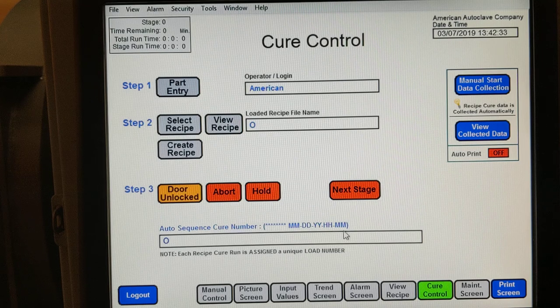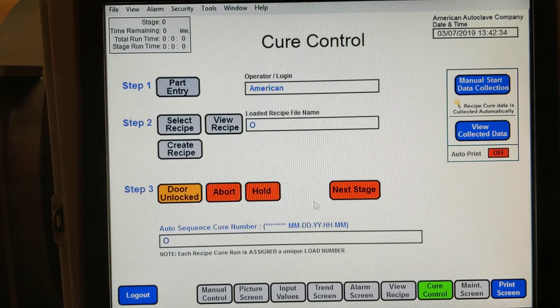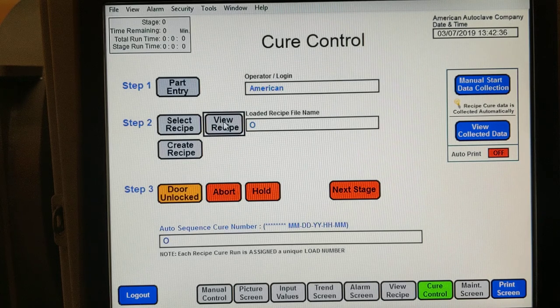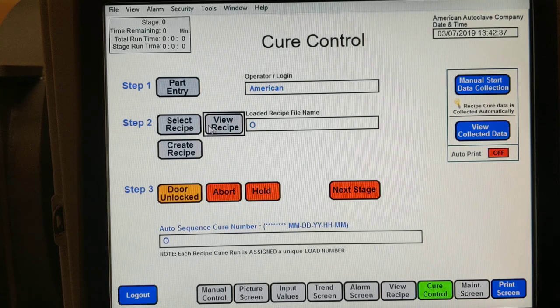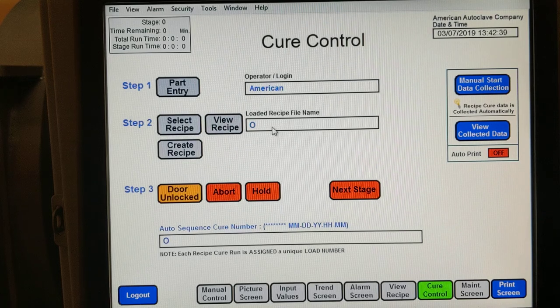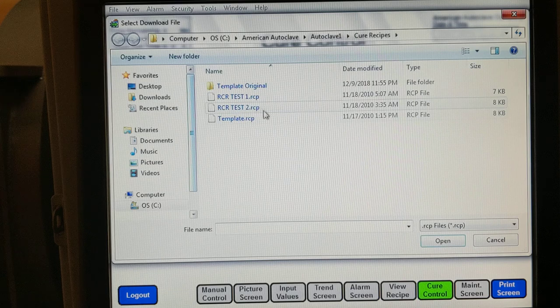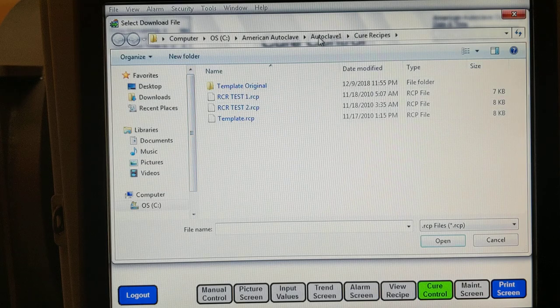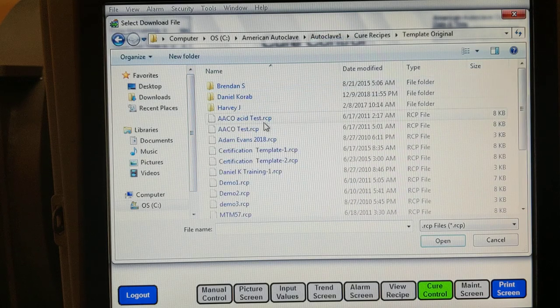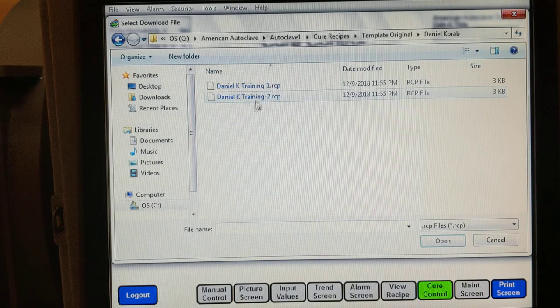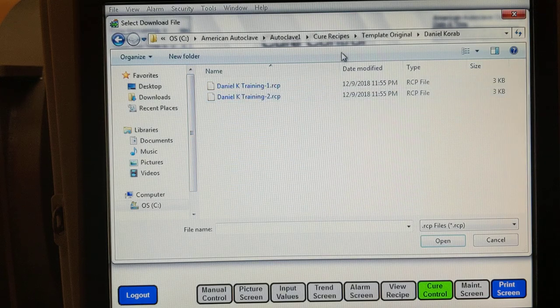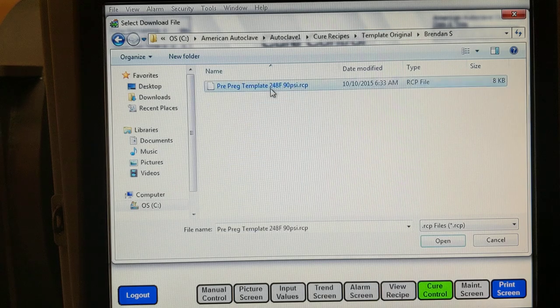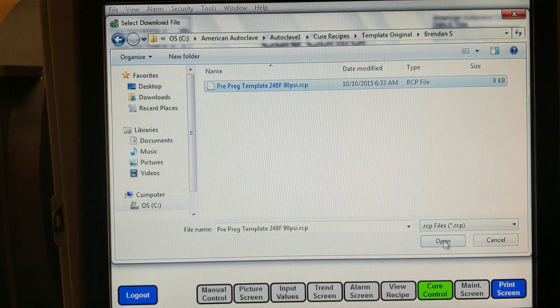Previously we had a problem because the recipe wasn't loaded up here. This is where it should be loaded. You do a select and navigate to where you want your recipe or which recipe you want to have loaded. Maybe we'll pick this one for example.